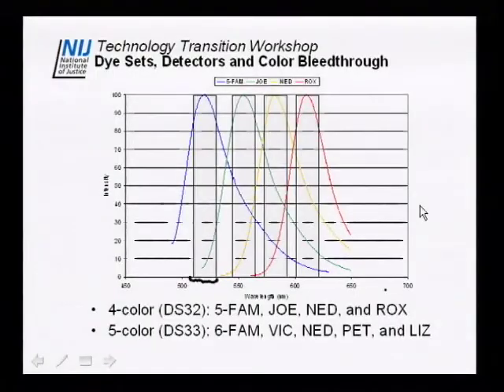The second thing about detection is, as you remember from yesterday, all the wavelengths come into the detection box. And from this detection box, a number of mirrors and bandpass filters are used to split this wavelength into 5 different detectors. So what I've represented here is the detection window of a detector. In this case, it's around 20 nanometers wide, and that would be the bandpass filter. And it's centered, for this example, on the blue. So this would be detector number 1, designed to detect blue.